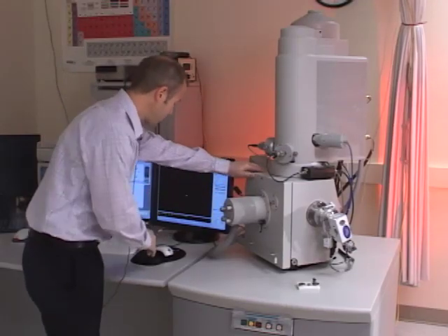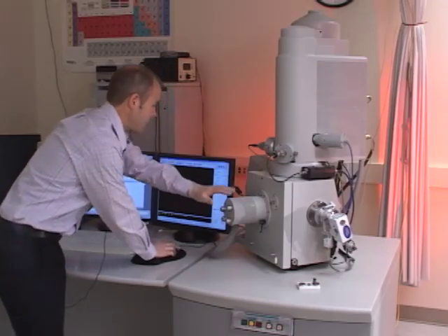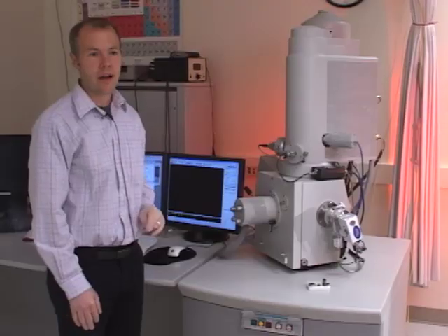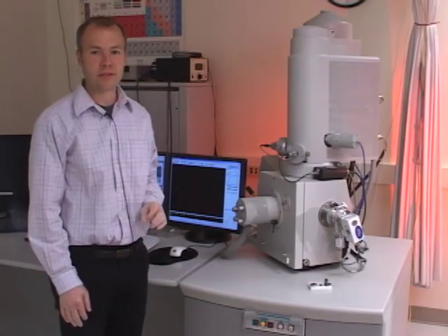Once the chamber door is closed, I'll hold it with one hand and re-engage the pump. It takes about two minutes before it reaches vacuum. At that time we can open the column valve and actually view the sample.